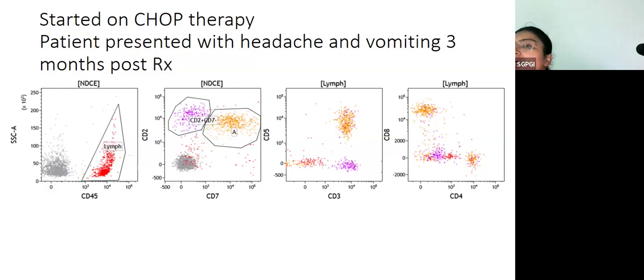Sometimes you may be diagnosing a lymphoma primarily on a fluid flow cytometry. So in this case, when you look at the flow, we did not restrict the 45 side scatter gate to only include the low scatter cells. We actually let it be a wide liberal gate. And if you look at the 2 and 7 split, remember that those cells were bright 2 and they lacked 7. If you have a look at these particular cells, they clearly are differentiated as 4-8 double negative, and they also express CD3. So our anaplastic large cell lymphoma had actually hit the CSF by this time.